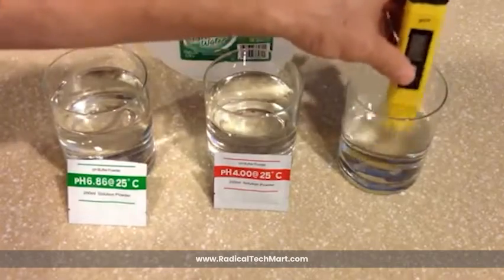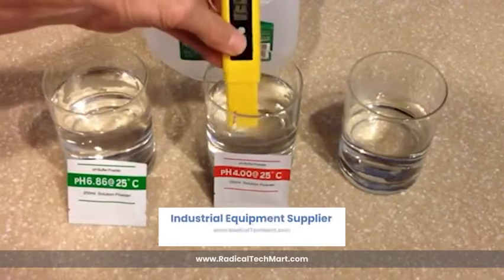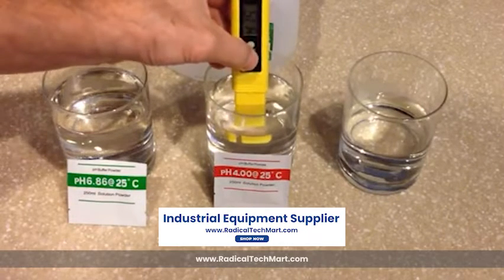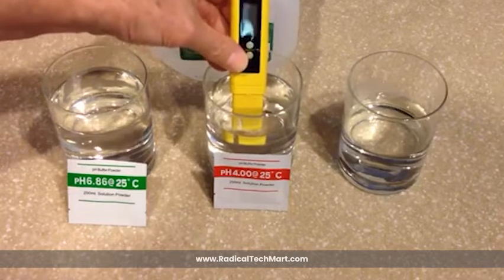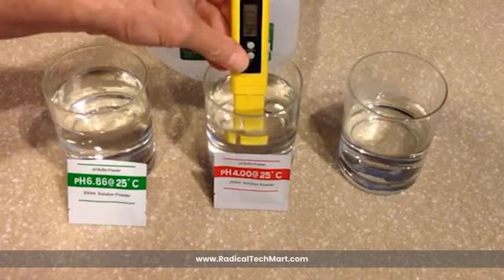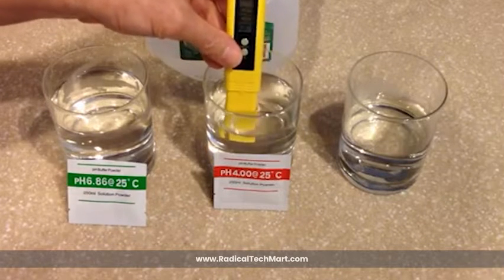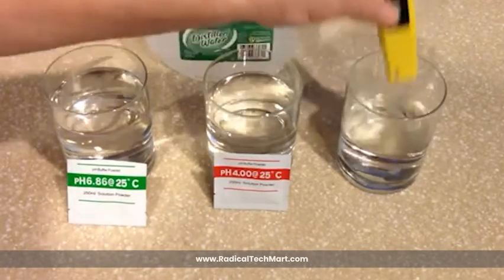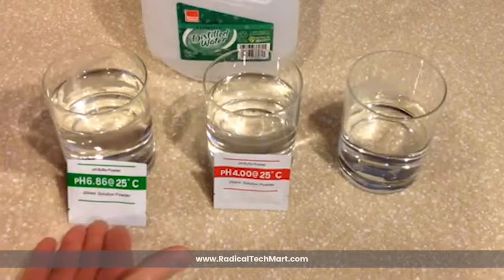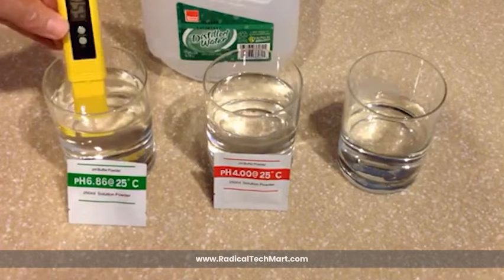Rinse the electrode with distilled water and dry it with tissue paper. Then immerse the electrode in the pH 4.00 solution. Press the CAL button for 5 seconds, then press and release immediately a second time. The reading will start flashing 4.00. Wait until the display stops flashing. Rinse and dry the electrode with distilled water as before. Place the meter back into the buffer solution to test calibration. If incorrect, please repeat the calibration.